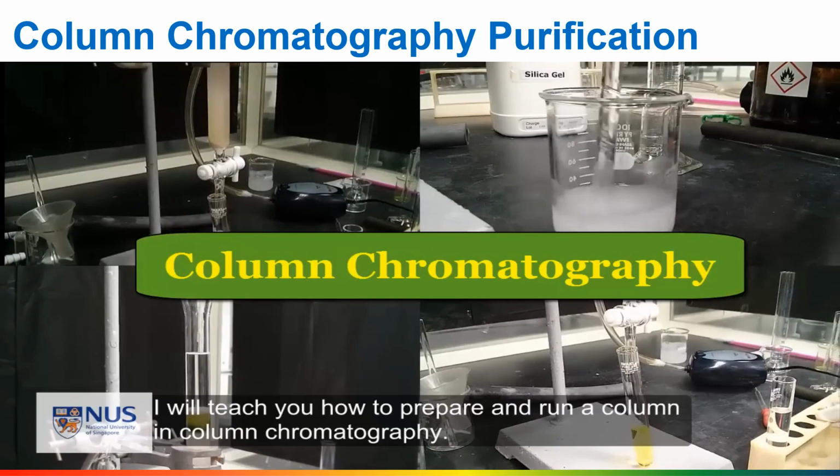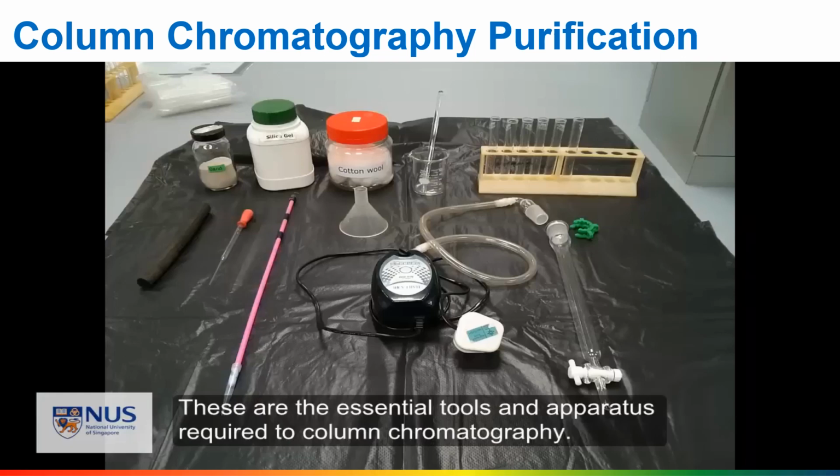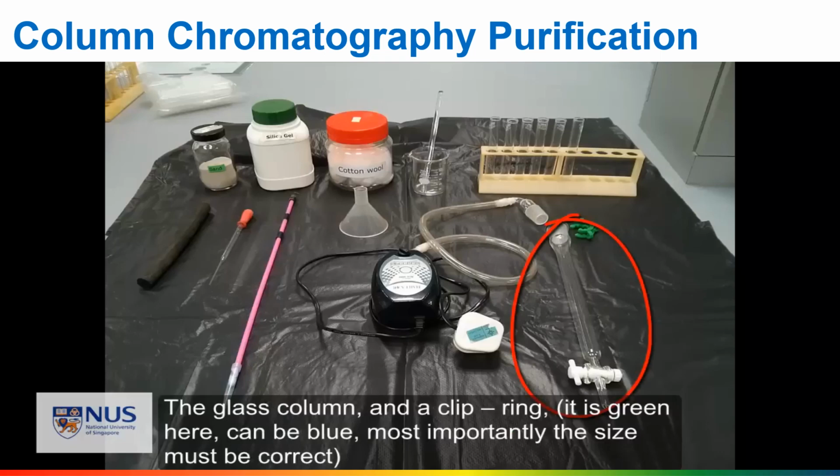I will teach you how to prepare and run a column in column chromatography. These are the essential tools and apparatus required to do column chromatography. The glass column and a clip ring. It is green here. It can also be blue, but most importantly, the size must be correct.